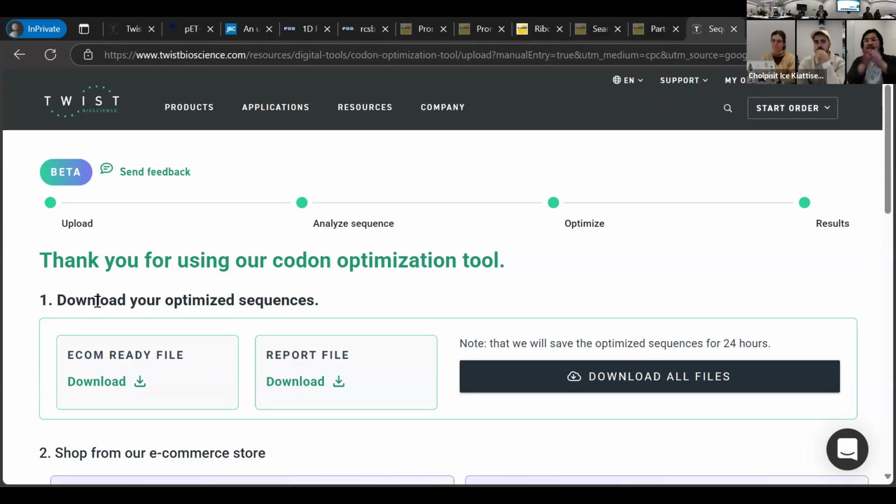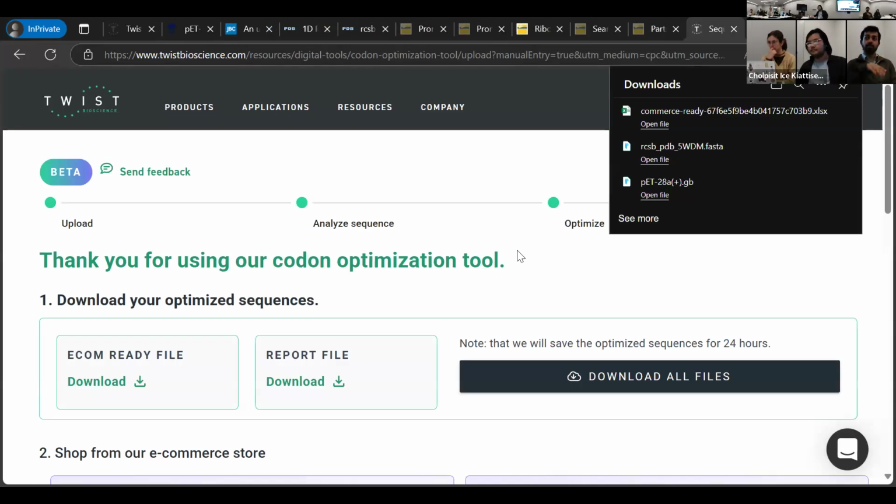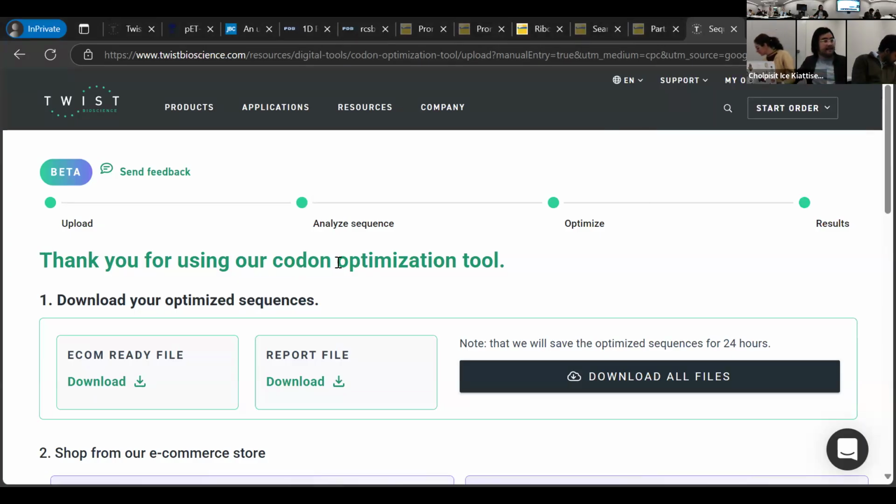Think about something that was like 1,000 amino acids. It's pretty easy for it to have some random sequence that can be recognized by your enzymes. So when you do codon optimization for the synthesis, it's good for the fragment to not have that part, so that you can do the design properly. And you can also use enzymes that we already have, right? For example, we have EcoRI and EcoRV, so it's very easy to say, oh, we have them, we can just go and cut them if we avoid those sites. So I skip a little bit, so it will return you this screen.